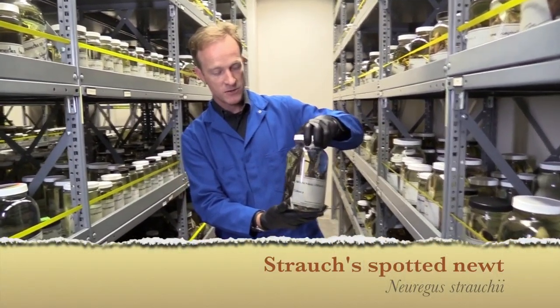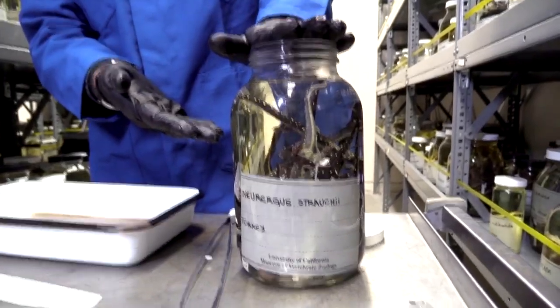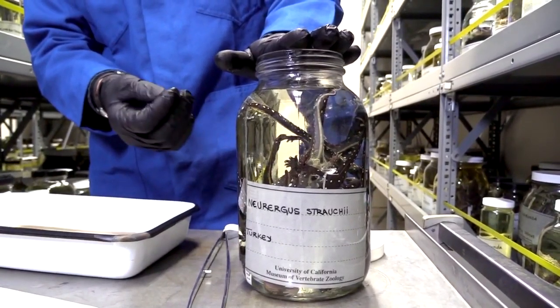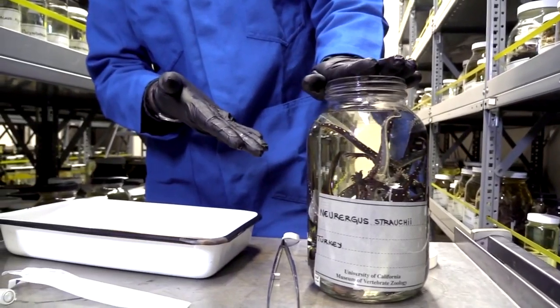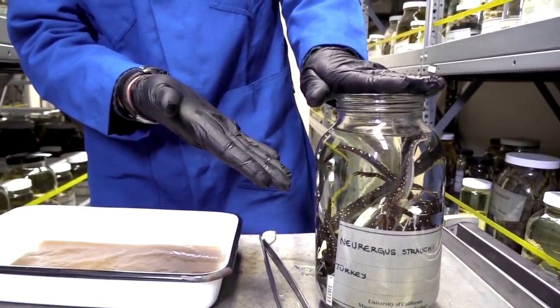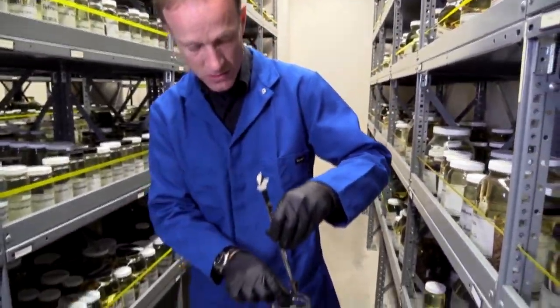I've got a jar of animals here — these are specimens, salamanders from the family Salamandridae, collected in Turkey. We're going to search to see whether these animals are infected with a fungal pathogen. We'll take one of the animals out and swab the skin. You might be wondering: if we get a positive, how do we know it's the animal I swabbed and not some of these other animals cross-contaminating it? That's a perfectly reasonable question, and I'm going to show you how we address that.